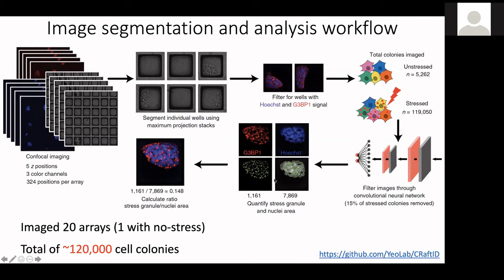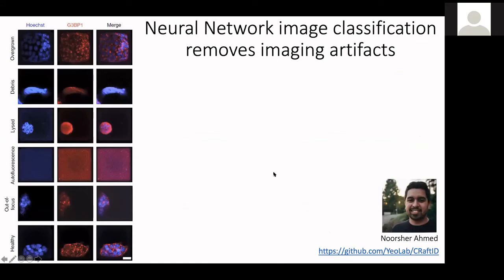So I think that with a lot of these imaging-based screening methods, coverage is much harder than using other platforms that are more compatible with high throughput, like simple growth rate or FACS-based screening. So it's definitely a delicate balance between the number of guide RNAs that you choose to use and the number of colonies or cells that you're willing to image and screen.